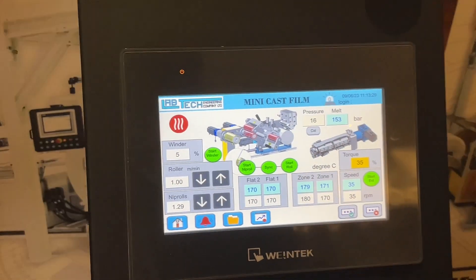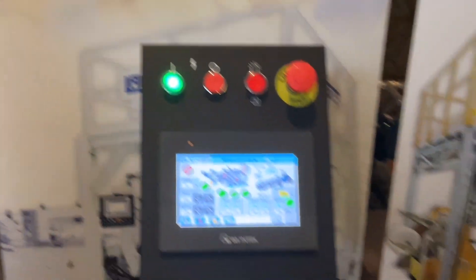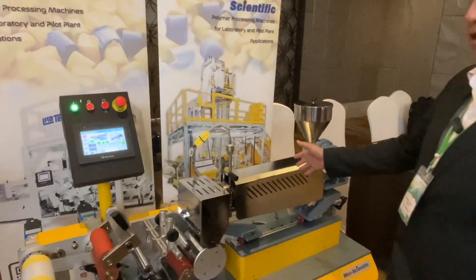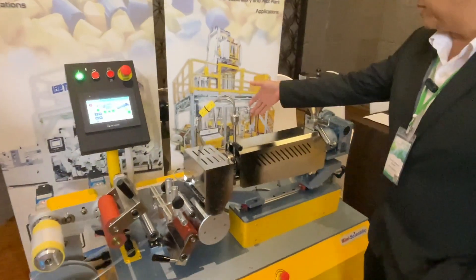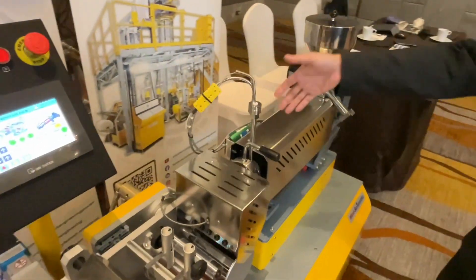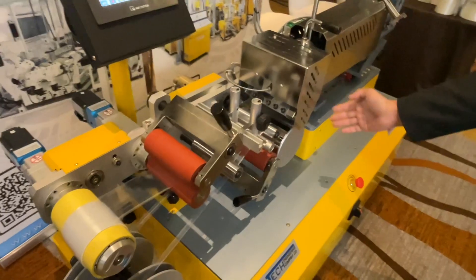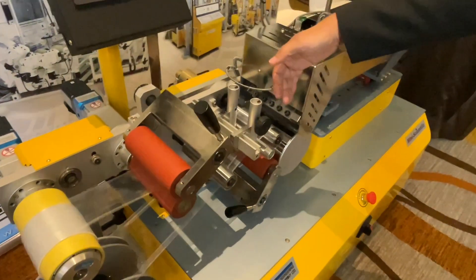This machine not only has this feature, it also has another cool feature. On the machine, we have the single screw extruder, the screw diameter is 16mm. And here, the pressure time sensor, and the flat die here. And also we have the chill roll here.